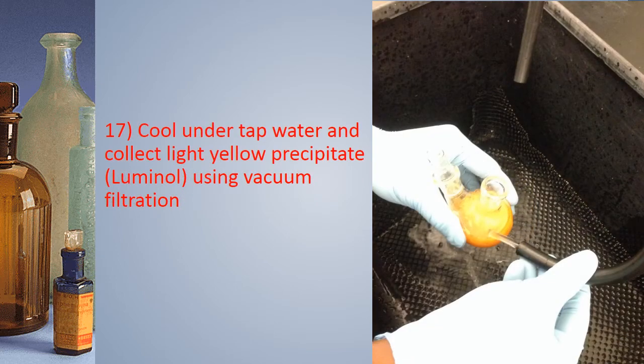We then cool under tap water and collect the light yellow precipitate, which is our luminol, using vacuum filtration.